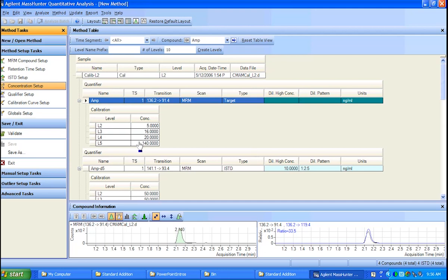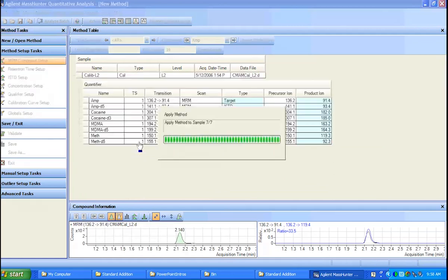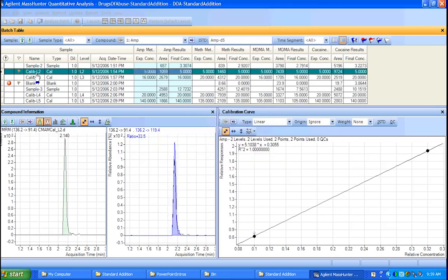With that set up in place, let me next show you the application to samples in Batch at a Glance. All right, let's go over to Batch at a Glance. What we'll see that I've got set up here is a sample and then calibration samples that follow.